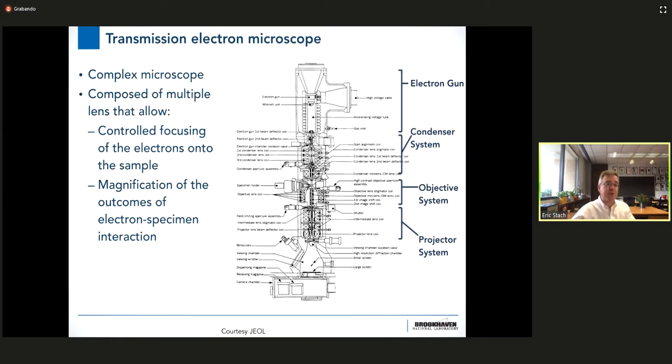The microscope is generally set up to have a region that gives you the electrons. That's the electron gun, they call it. The electrons come down to your sample with a wide range of energies. It's not uncommon to have machines that vary between 300,000 volts of incident energy down to as low as 80,000 volts, or different types of microscopes will even go as low as 30,000 volts. So the difference in voltage gives you differences in penetration, but of course also differences in voltage change the way that the electrons interact and can change the relative amount of damage that you have.